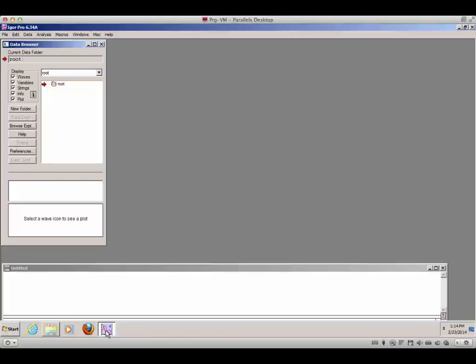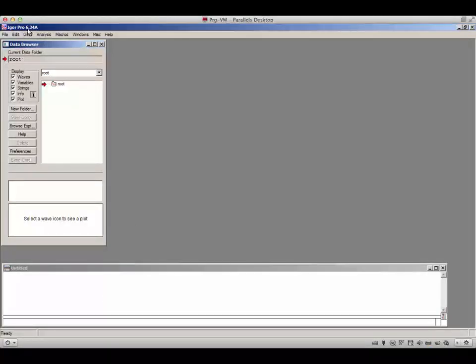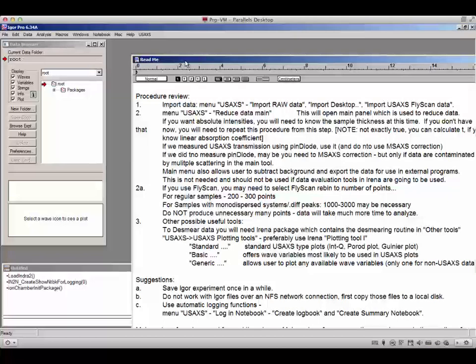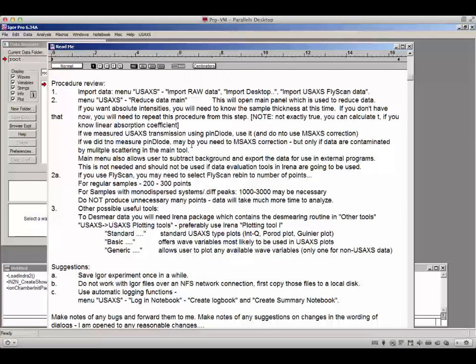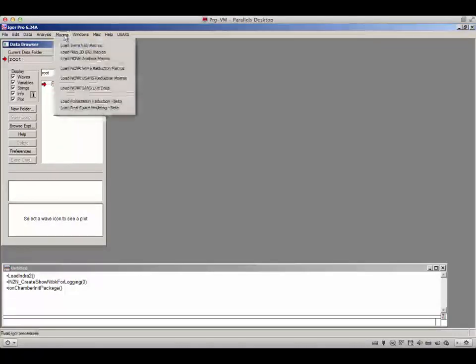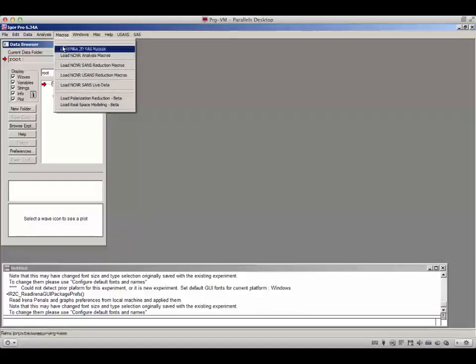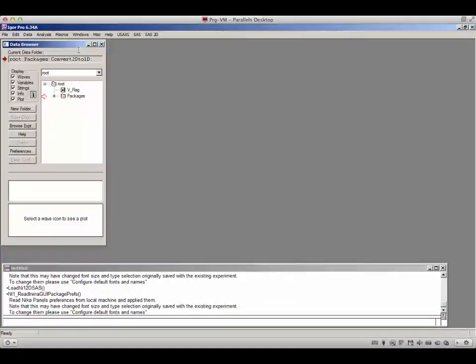The first thing is to start Igor Pro. The latest version is 6.34a. Start Igor Pro, zoom it to full screen, and load the USAXS macros. These macros will present you with a README describing what we are about to cover. You need the IRENA package, and you also need the NECA package for the ERA detector-based data for the SAX and WAX. With all three packages loaded, you can now start.